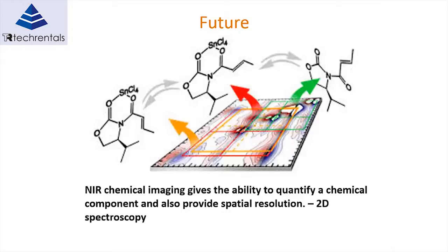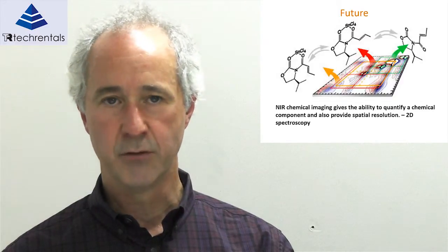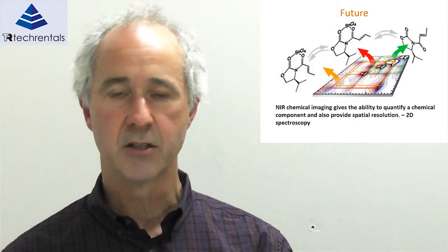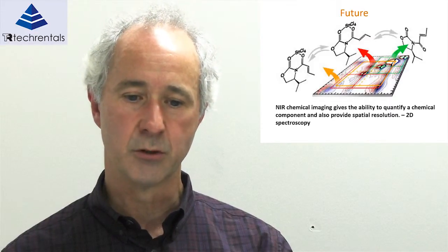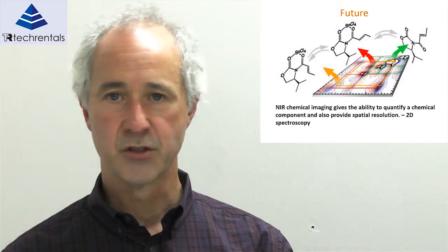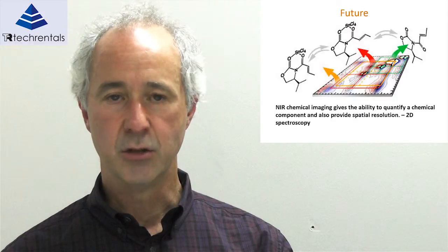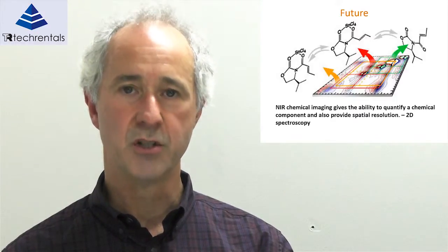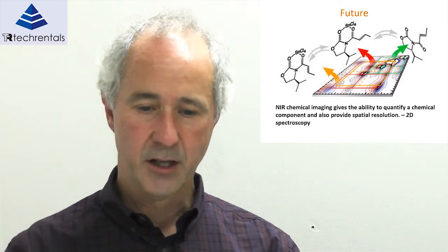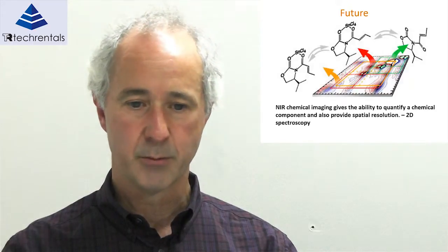Whereas these hyperspectral cameras will not only give you a picture of the object, but each pixel will tell you what wavelength it's responding to. So that'll be particularly useful for, say for instance, mapping the whole surface of a block of cheese, and you'd be able to determine over the surface of the cheese what the protein level was at each pixel. And depending on what the product is, that may or may not be useful.